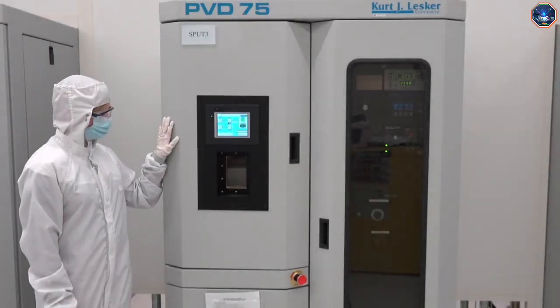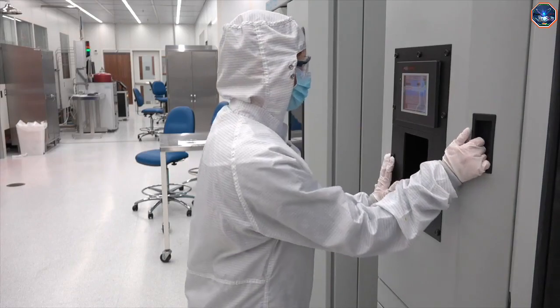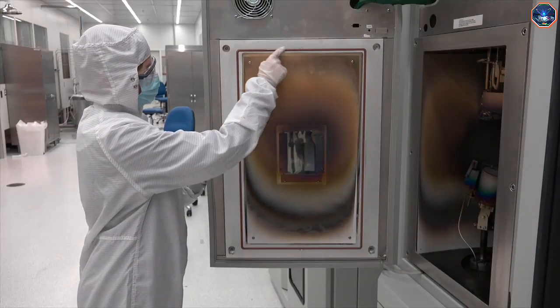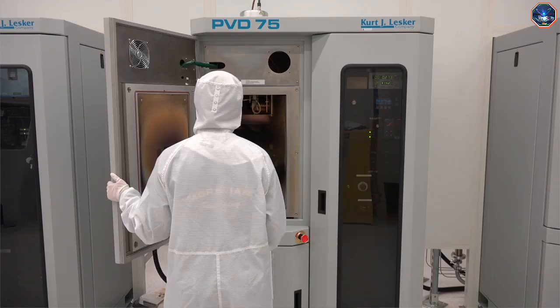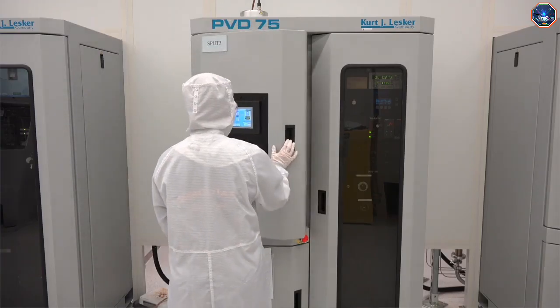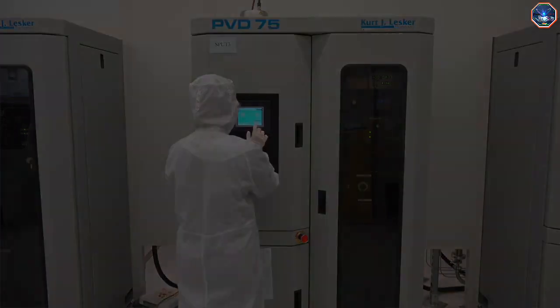That sounds great, thanks. This is a metal deposition system, and we can see the place inside where the vacuum pumps will remove the air from the chamber. This orange rubber ring is a vacuum gasket that seals the chamber from the outside air when we close it. Let's close it now, and we are ready to pump the chamber down to vacuum.